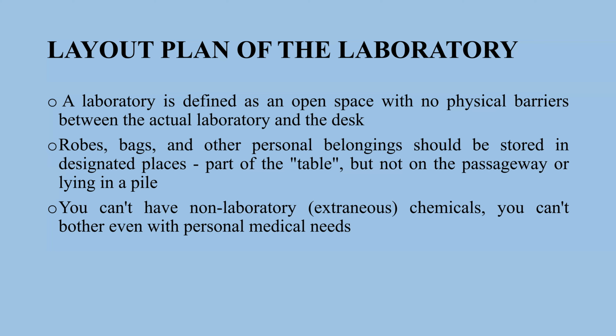It means we should keep all our things in order and store personal belongings in some designated place. It could be part of a table for this activity.